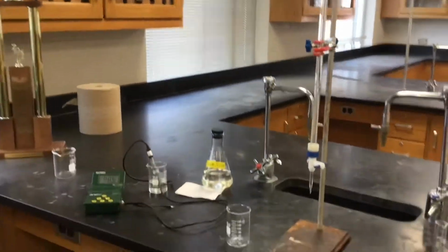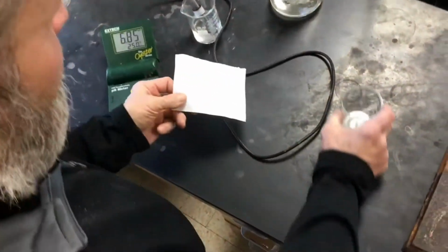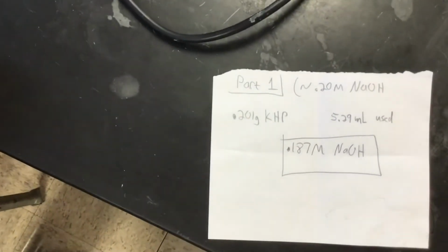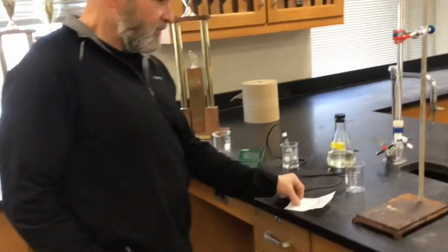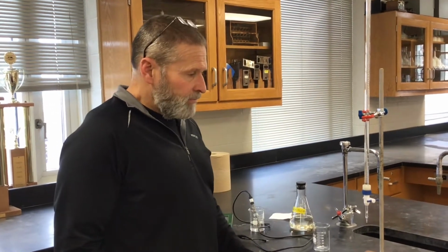Now I can tell you the concentration for this. Concentration of the NaOH is 0.187. Standardized it yesterday. Okay, so for part one of this lab, we're titrating a strong acid with this standardized NaOH. Your goal is to use the data to create a titration curve, use the titration curve then to help figure out the concentration of the acid.